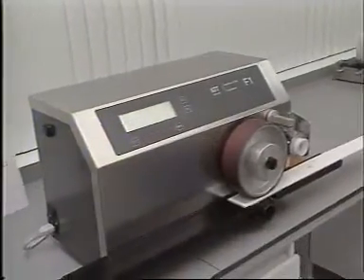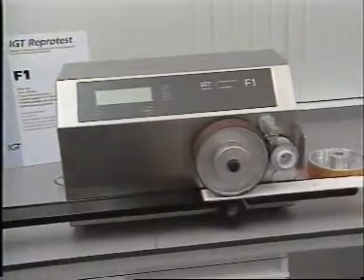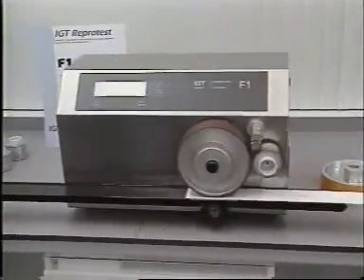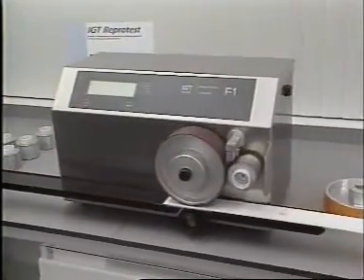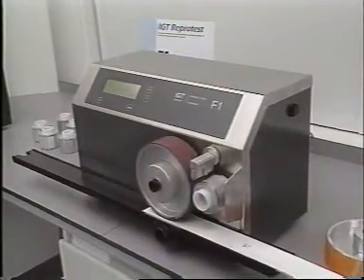The F1 is used to print substrate strips with flexo inks in an ink film thickness which simulates actual practice. The prints are used, among other things, for spectrophotometric or visual appraisal of the colour to determine gloss.